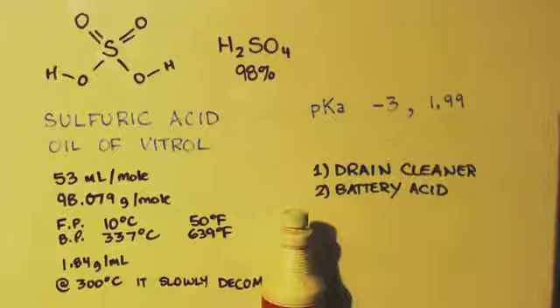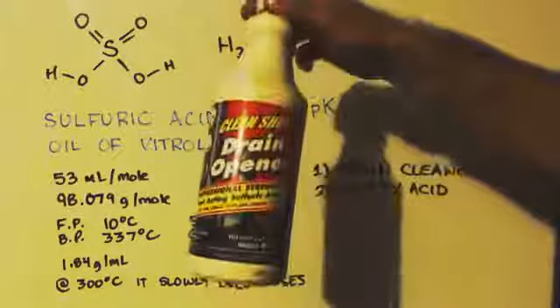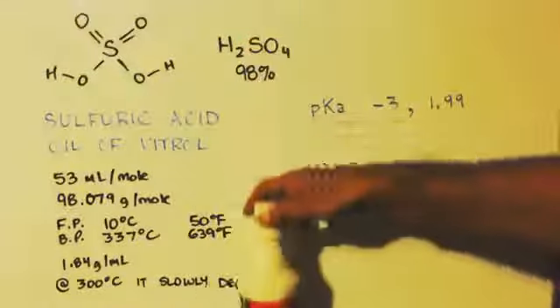And you can put it right in series with your water pump that you're using on your water cooled condenser. And that way you don't have to put it on your spigot on your sink and keep losing water down the drain. You can recycle it and you can make it colder. The colder the water is, the better the vacuum is. But anyways, I will be showing that sooner or later.